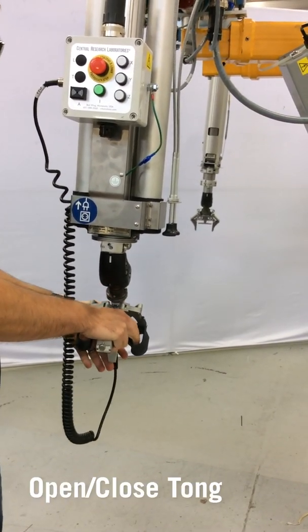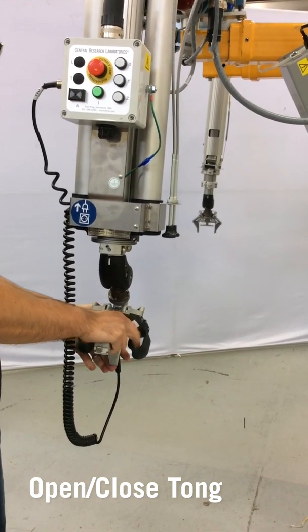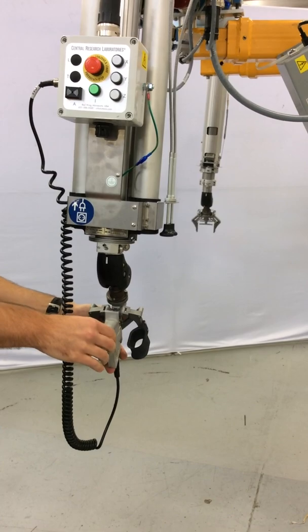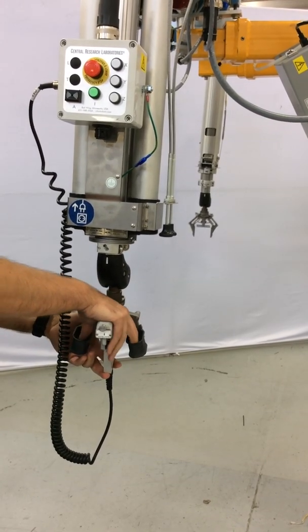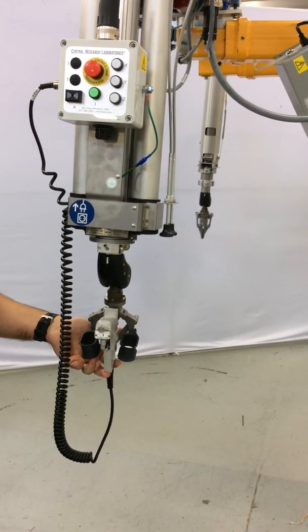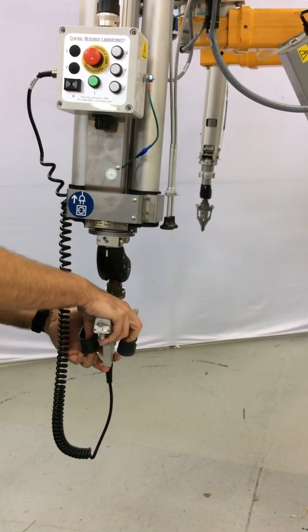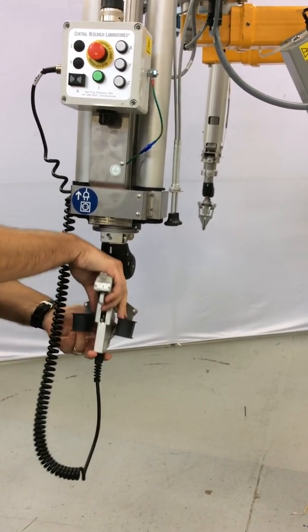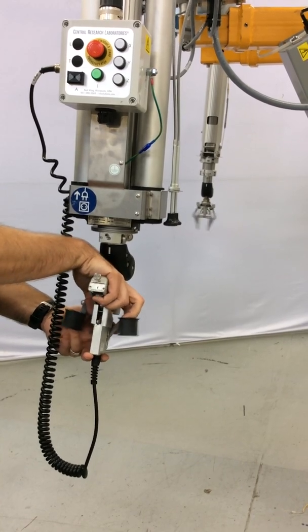You also have the ability to open and close the tong by squeezing the handle. This handle also has a ratchet lock feature which will hold the tong closed until it is released. To release, you squeeze the trigger.